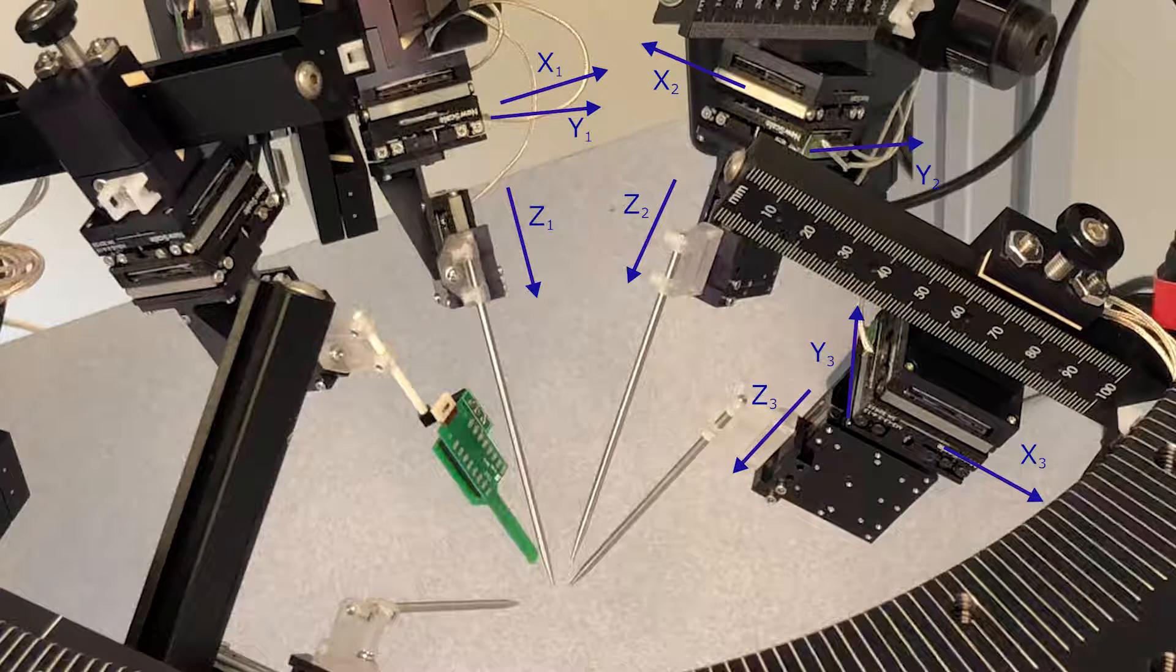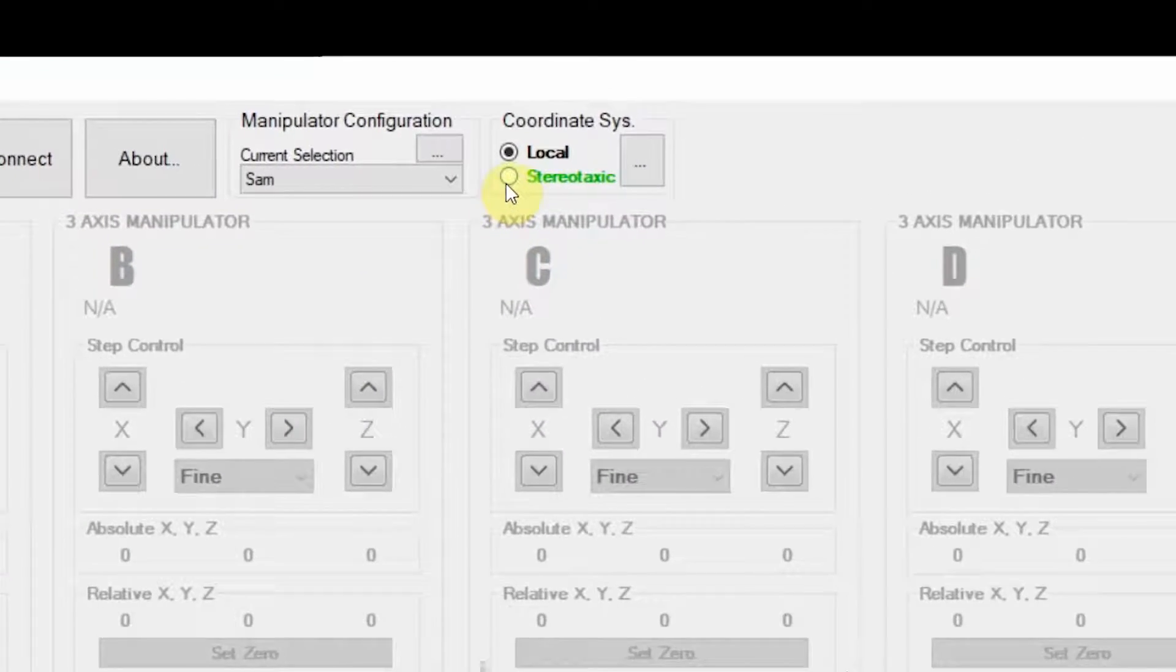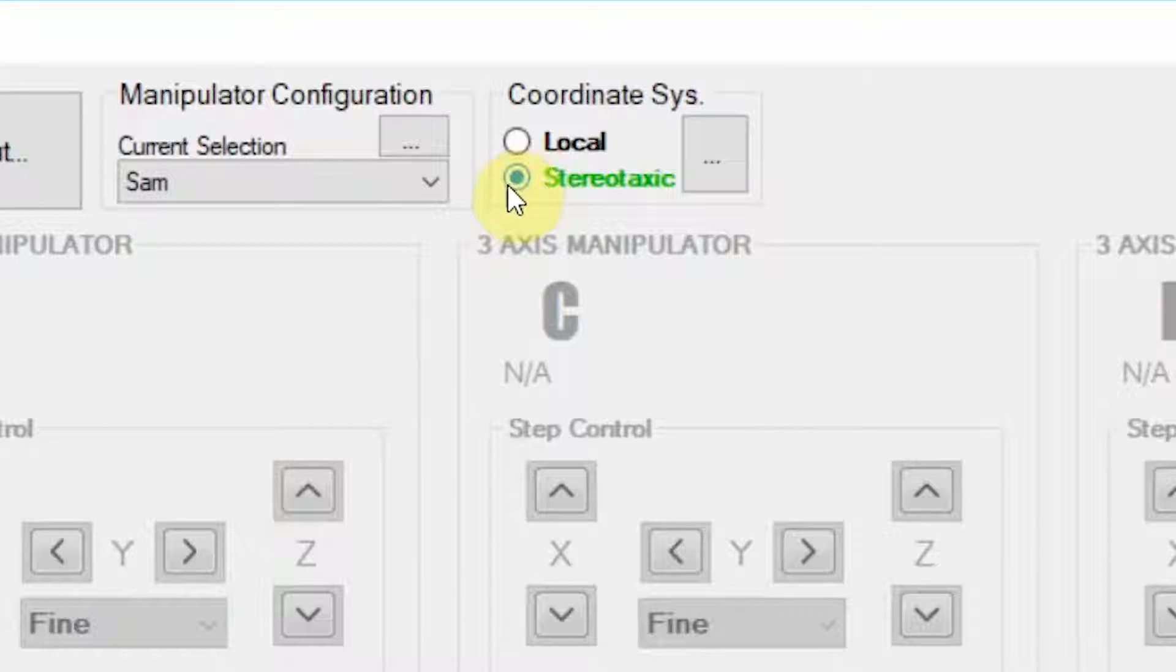When the virtual coordinate system is not active, each manipulator moves in its own set of orthogonal X, Y, and Z axes. When VCS is activated, the software interface will change to green.